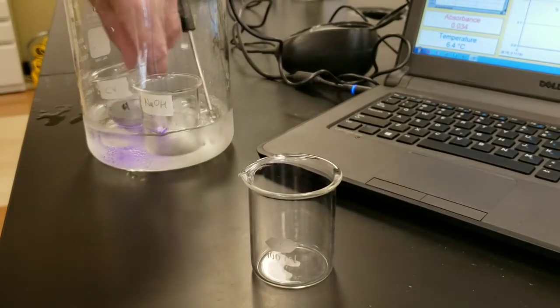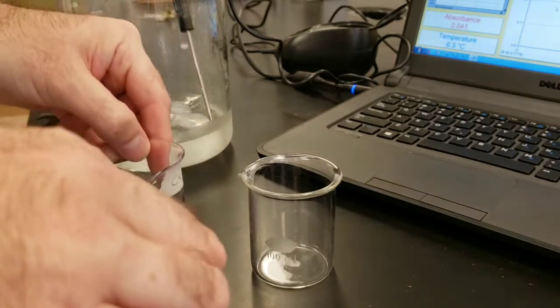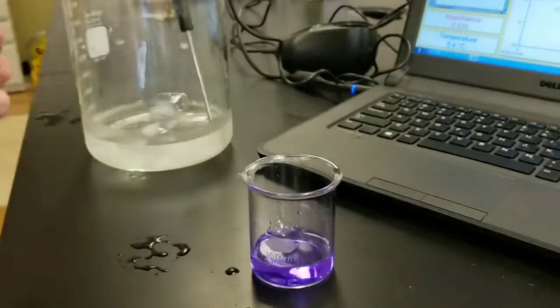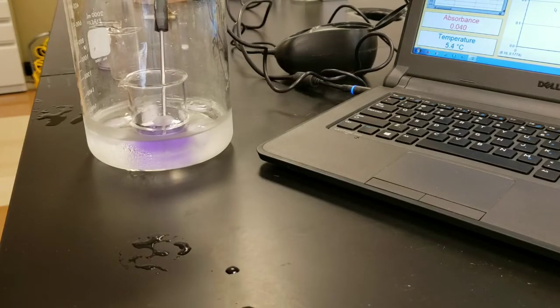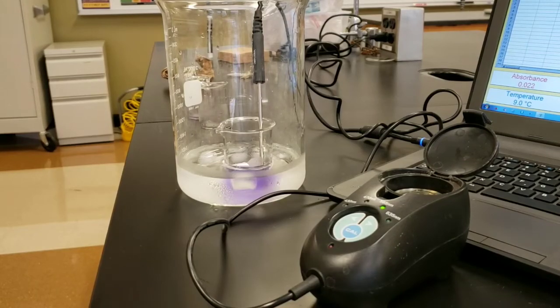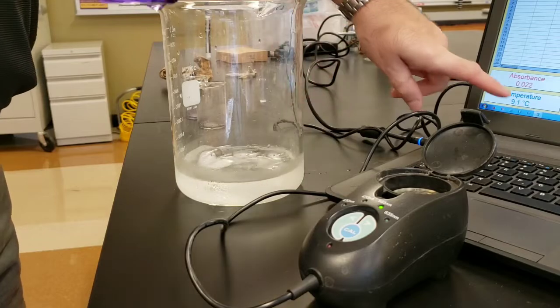Take the 2 solutions out of the cold bath, pour them together, give that a stir, put it back into the water bath, and measure the temperature inside the flask. Let it stabilize for 1 minute. After 1 minute, note what the temperature is.